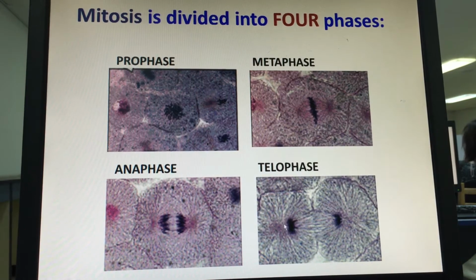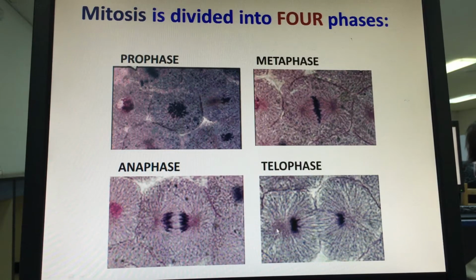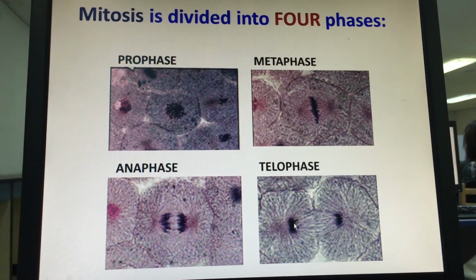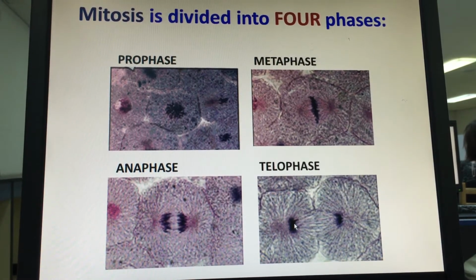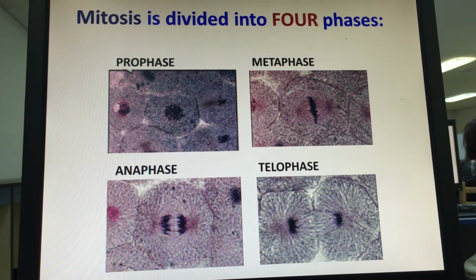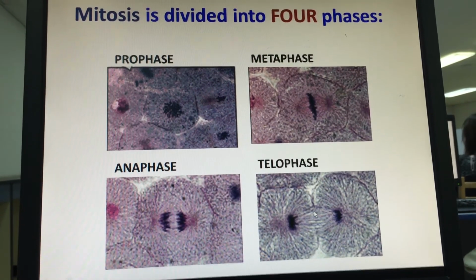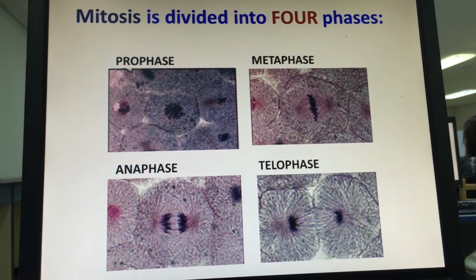Each set of chromosomes will align themselves at the different poles of the cell. In the prophase, we started to see condensation, while in the telophase, you're going to start to see decondensation. The chromosomes will form back into a chromatin mass once again. The telophase overlaps with the separation of the cytoplasm of the cell; as you can see here, the formation of a cleavage furrow during cytokinesis. Of course, these are all animal cells, right? They are rounded cells with irregular cell membranes all around.